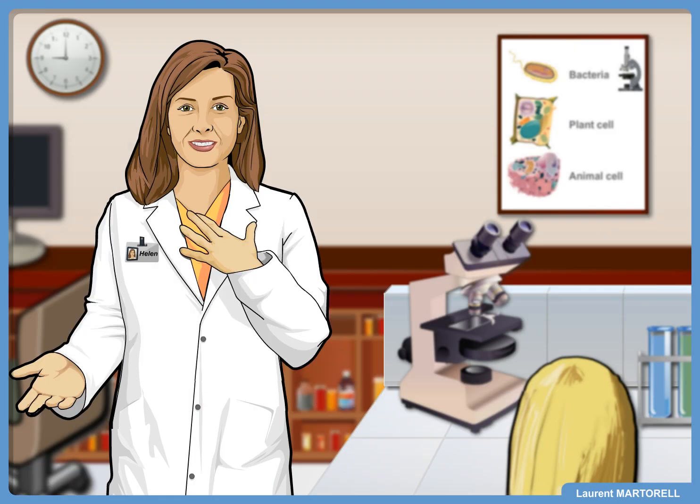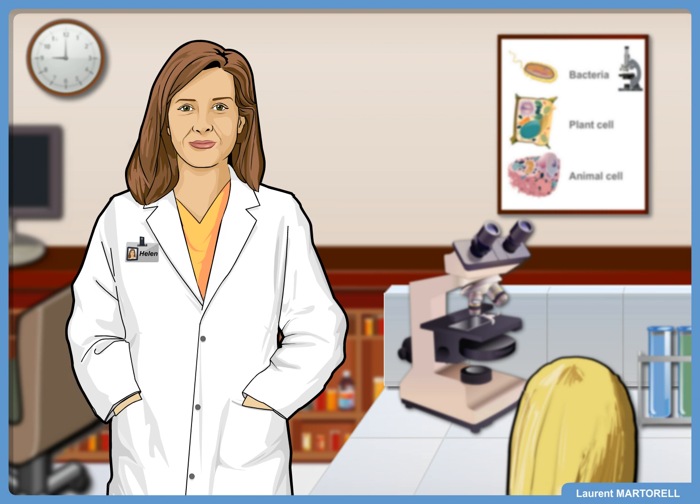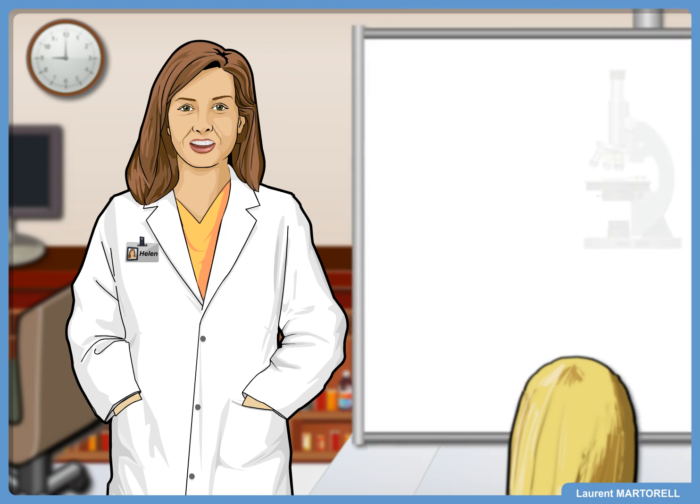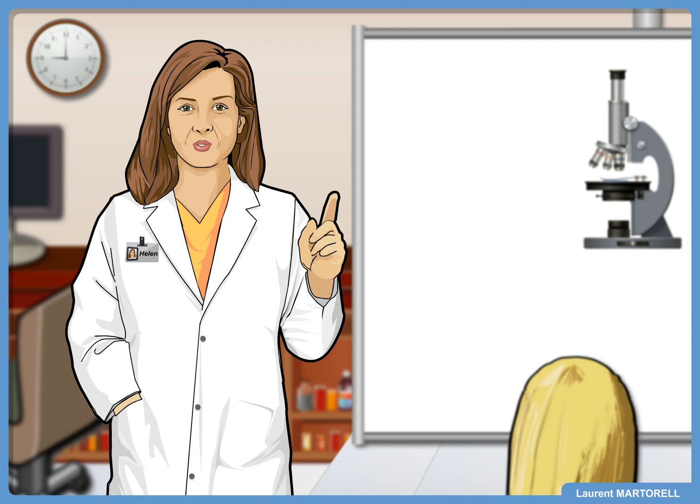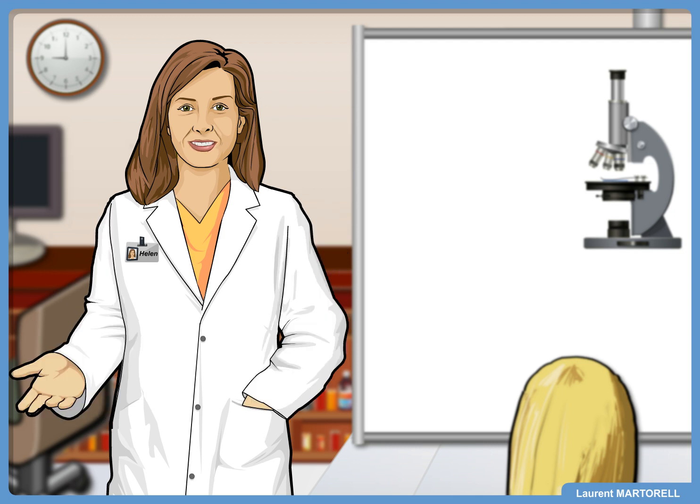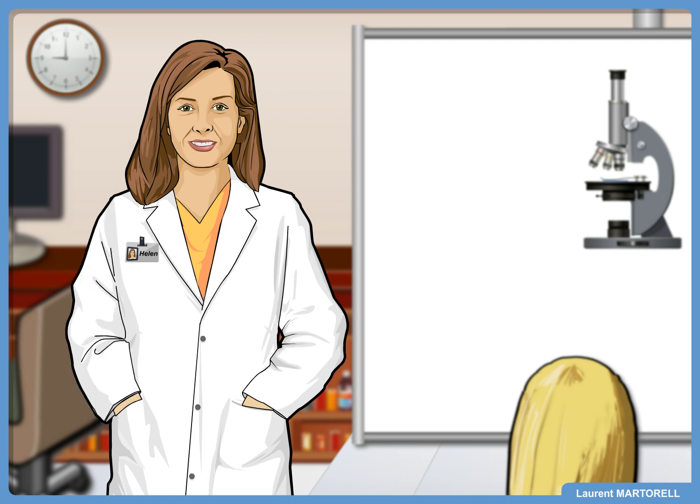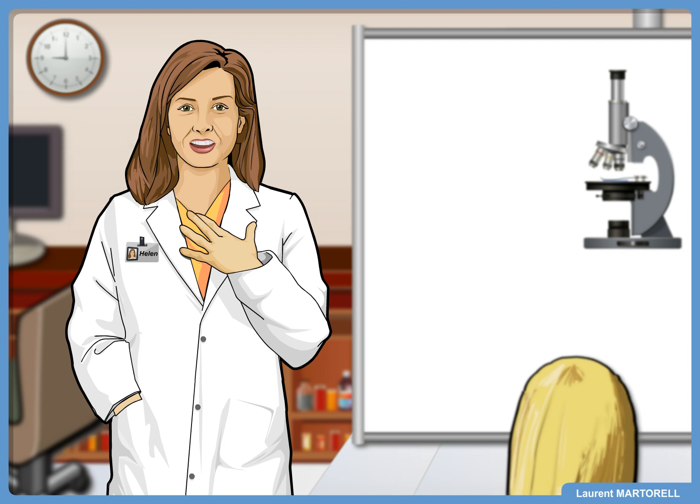Hello, my name is Helen. In this 'What Is' section, we are going to talk about the light microscope. The light microscope, or the compound light microscope I should say, is the must-have equipment in a laboratory. As a lab technician, this is obviously something you will use every day.